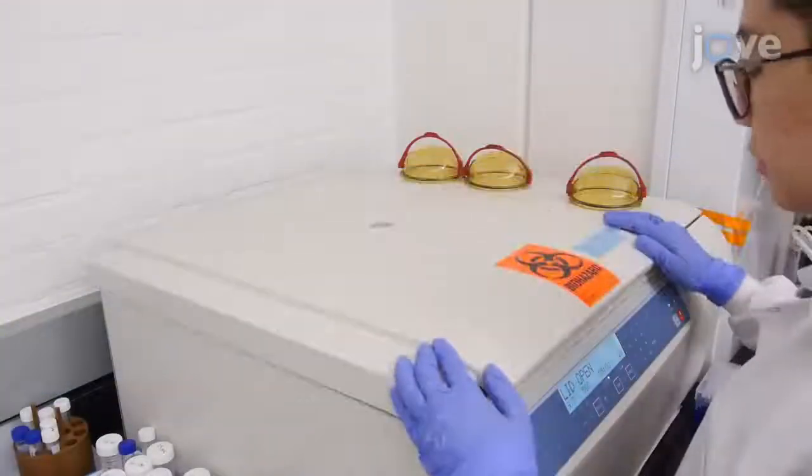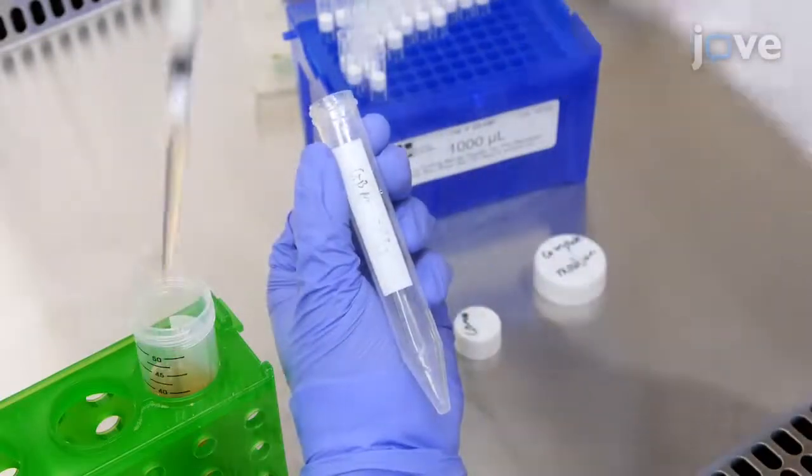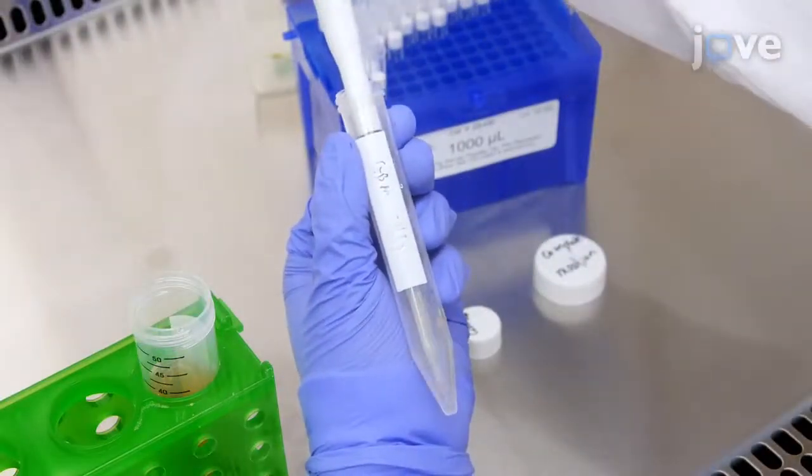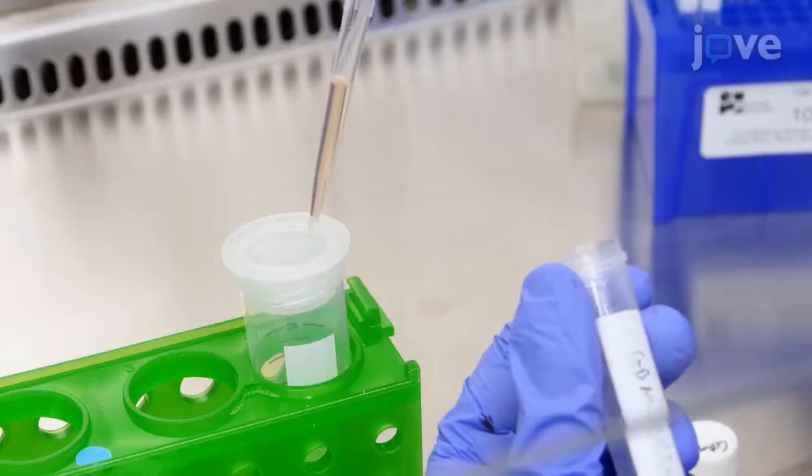Centrifuge the cells again and re-suspend the pellet in 1 milliliter of fresh complete medium before straining the cells through a 70-micrometer filter.